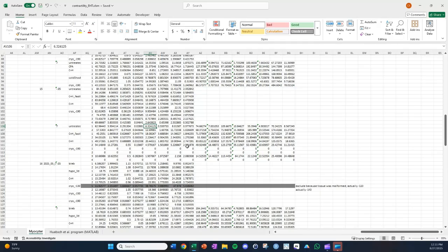So if you ever read 6.3 microns per second in one of these papers using such an analysis method, I would be very skeptical that that's actually the real value. It could be an order of magnitude off in either direction, is my sense based on messing around with this a little bit. But these percent values, I think, are much more meaningful.